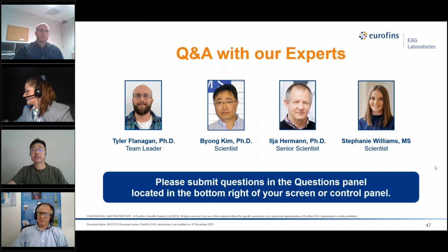Okay, and I'm going to open this up and anyone feel free to answer this question. Can the local dielectric constant be measured using scanning capacitance?